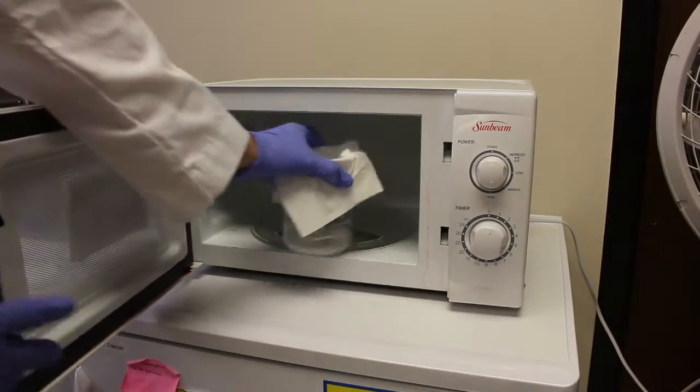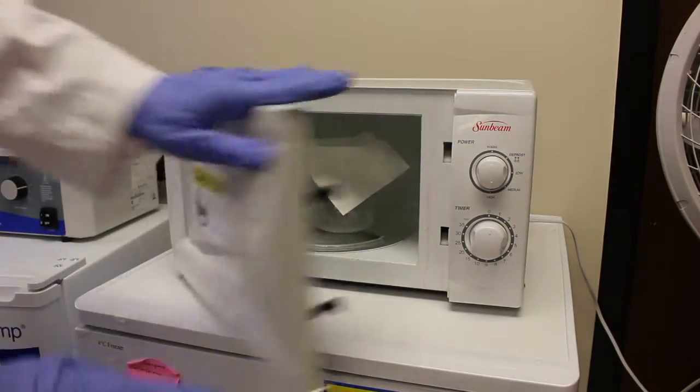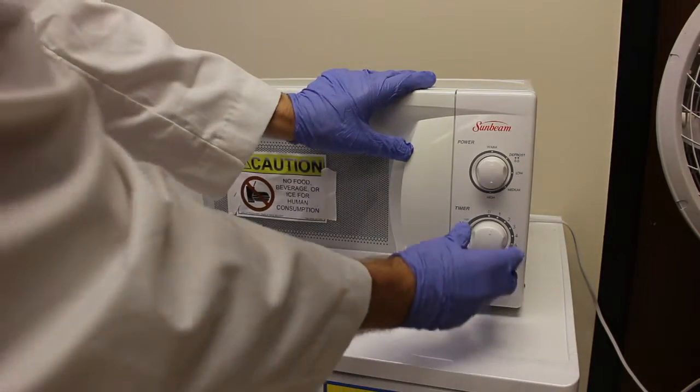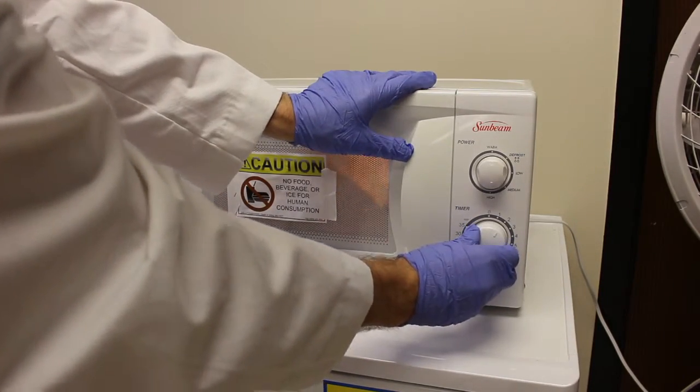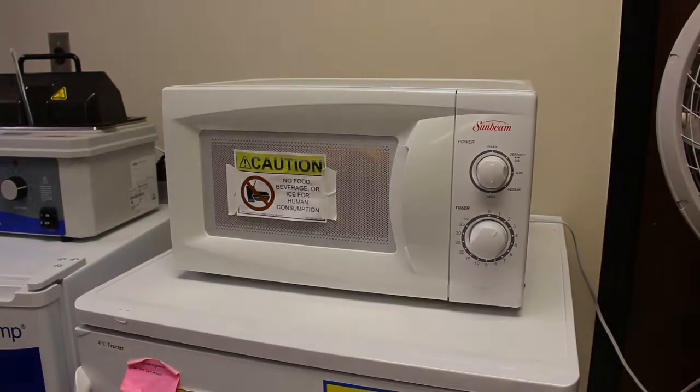Cover the beaker with a paper towel to prevent boil over. Place it within the microwave oven and heat on high for around 20 seconds. Heating times often vary widely depending on the age and efficiency of the microwave.